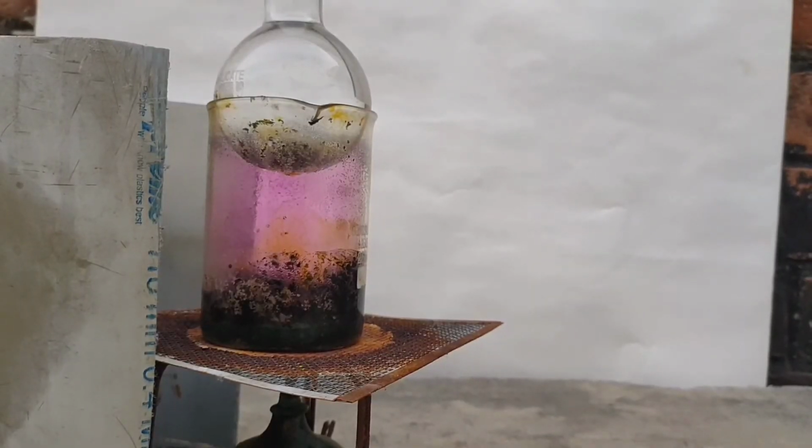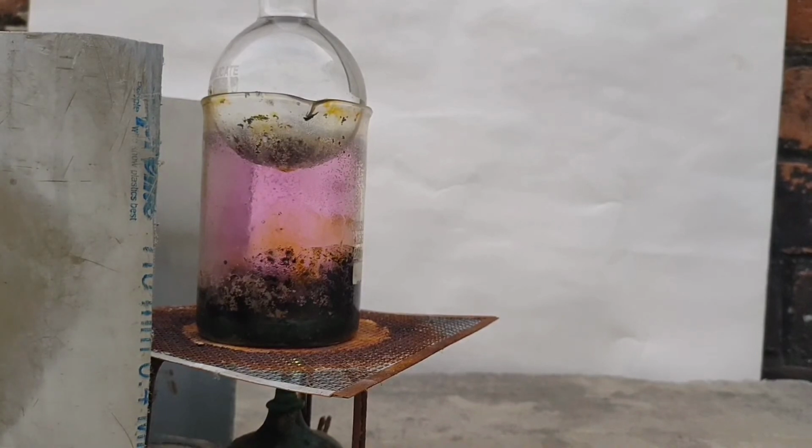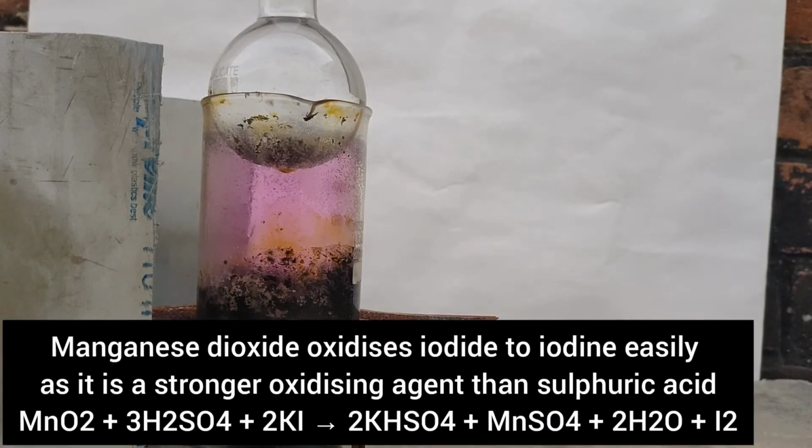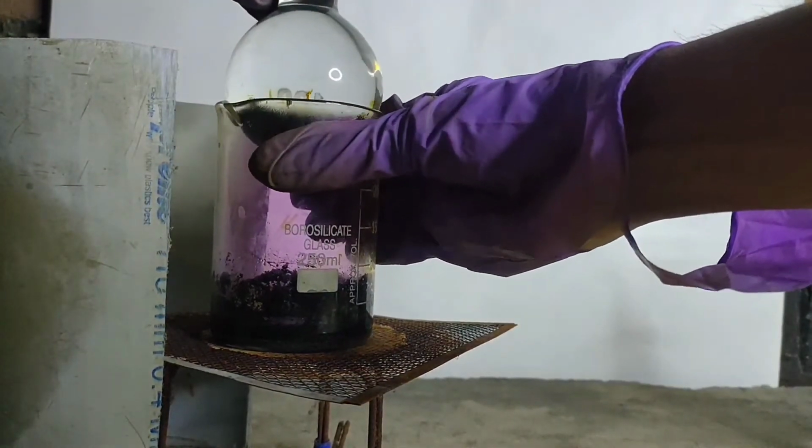Now I added some more sulfuric acid and I also added some manganese dioxide so that more iodine would be evolved. And you can see that I have got some crystals. So these are the crystals that I have got in my second run.